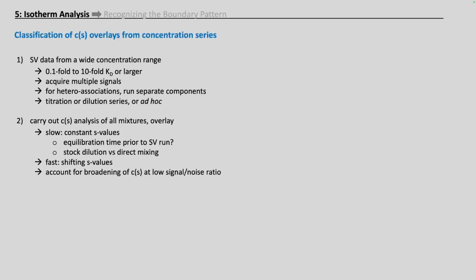And then we carry out a c(S) analysis of all the mixtures, copy the distributions and look at the overlay. You can do that in Excel. I have a little MATLAB script, or often the most convenient approach is GUSSI.